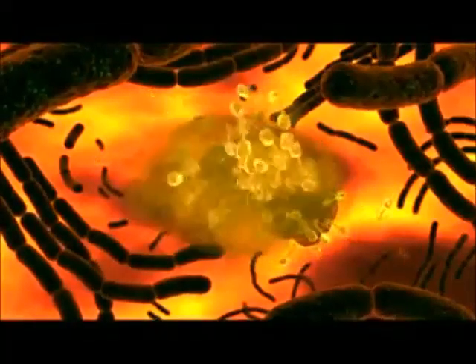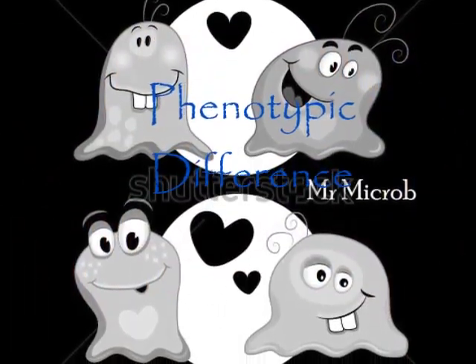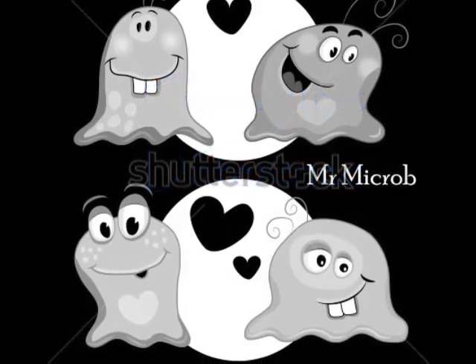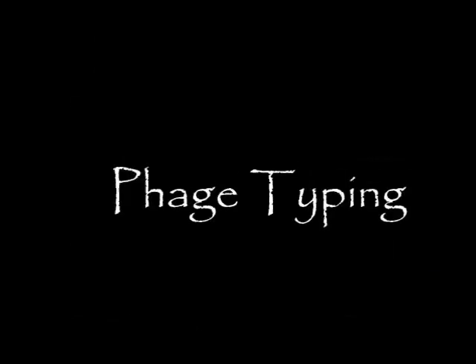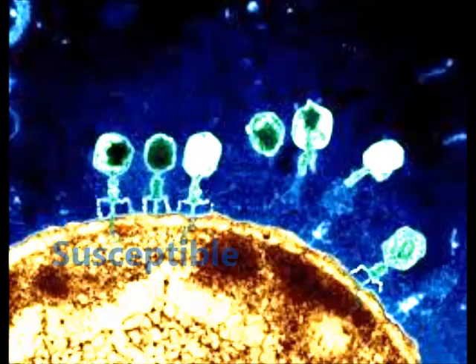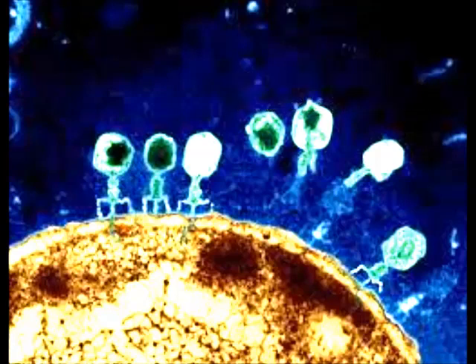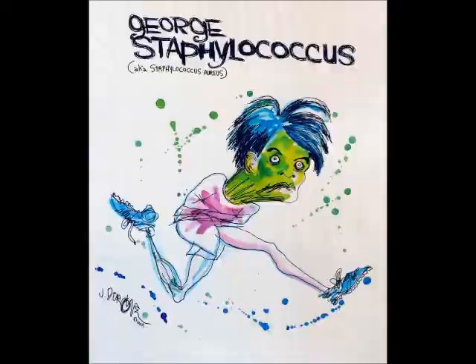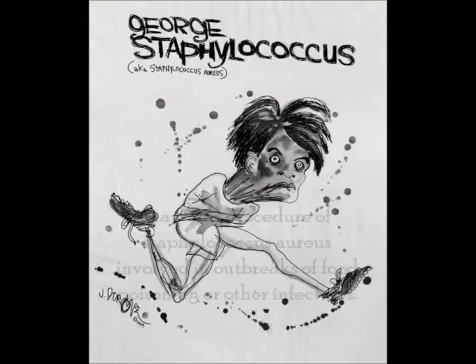Susceptibility to lysis by a particular phage may be the only apparent phenotypic difference between two bacterial strains, and may be the only means by which a strain causing an outbreak of disease can be recognized. This observation is the basis for phage typing, a procedure for characterizing and detecting bacterial strains by their reaction, whether susceptible or resistant, to various known strains of phage.